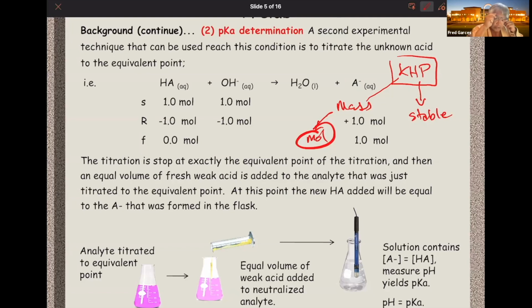So in other words, he may have precisely determined the concentration of sodium hydroxide for you, but if it's being stored and it's not closed and pumped with nitrogen, the concentration of that sodium hydroxide will drift. And if you're doing precise work, you're going to need the exact concentration.